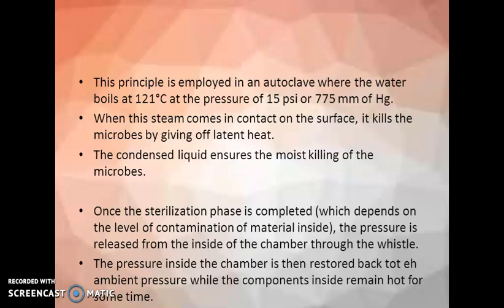The pressure inside the chamber is then restored back to ambient pressure, while the components remain hot for some time. That's why when we open this cooker, the materials are still hot.